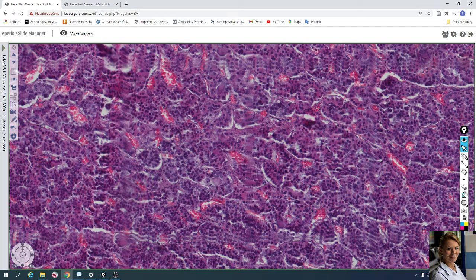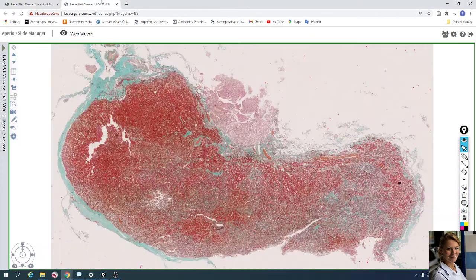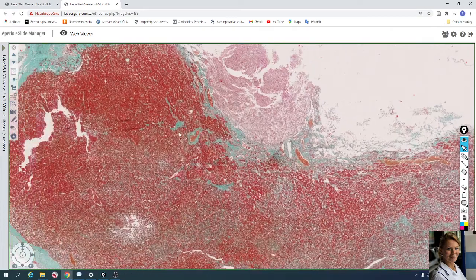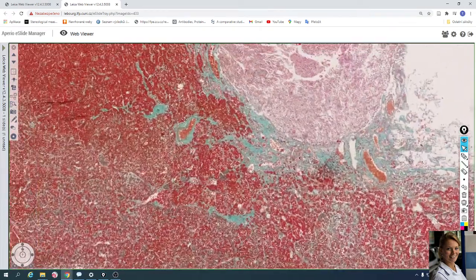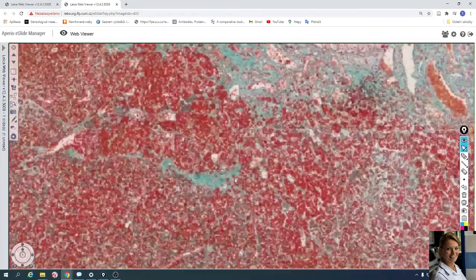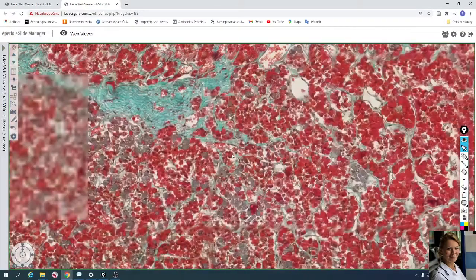This is the pituitary gland in hematoxylin-eosin. The second slide is stained with modified trichrome, and we can see the anterior lobe and the three types of cells.